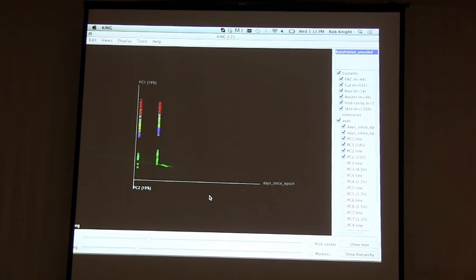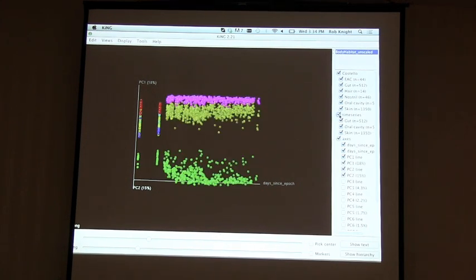You can kind of see the 3-month interval, but it's very difficult to get at dynamics, right? What you'd really like to do is go back to some of the same people and sample them every single day for like a year and a half. So with the Illumina technology, it was finally cheap enough to do that, and it looks like this.